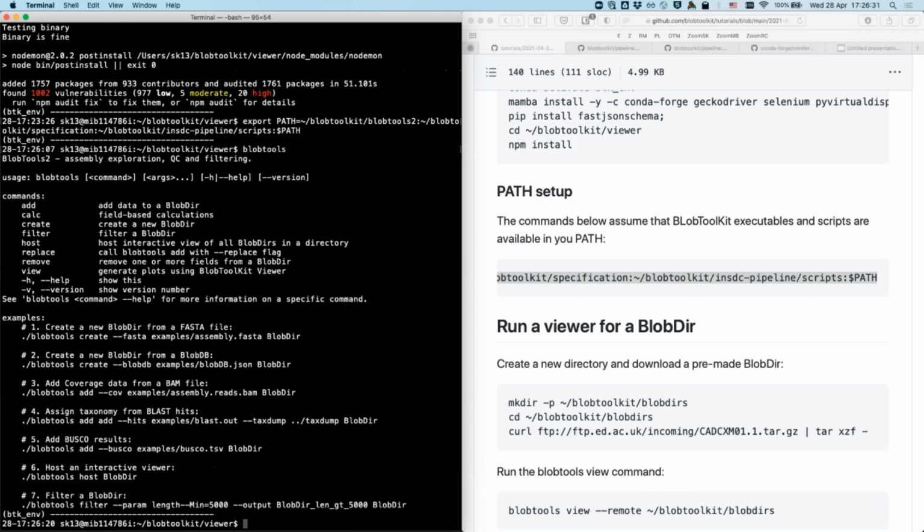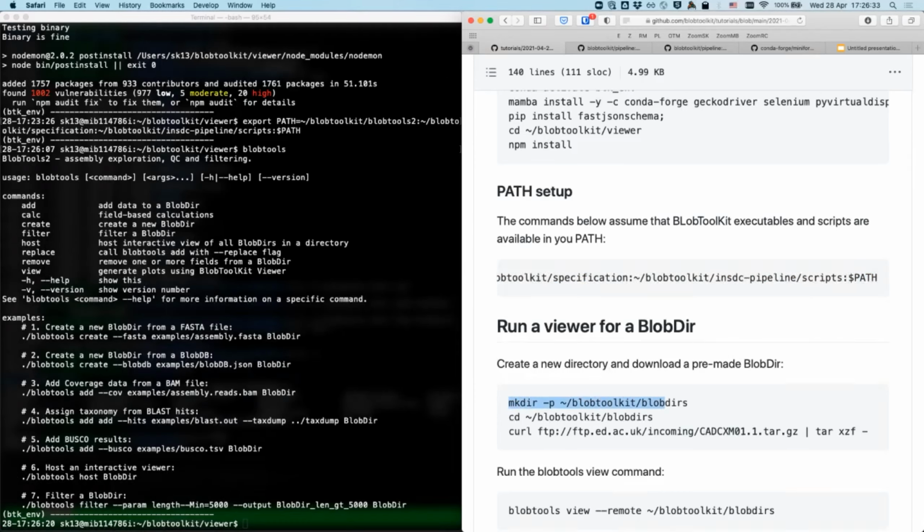And now we're going to create a new directory. Aurelian, is it okay if I go ahead and then you just copy and paste the commands and follow along later? Yes. Okay, cool. And same for anybody else. If you're waiting for things to finish running, you just have to copy and paste the commands, but you can follow along with what I'm saying as I'm doing it.